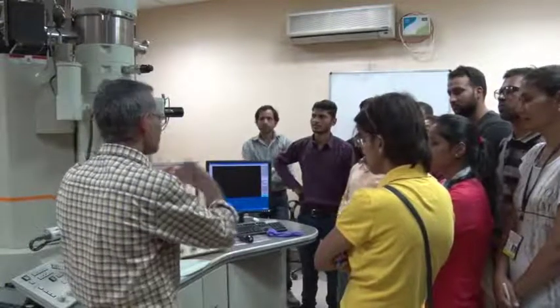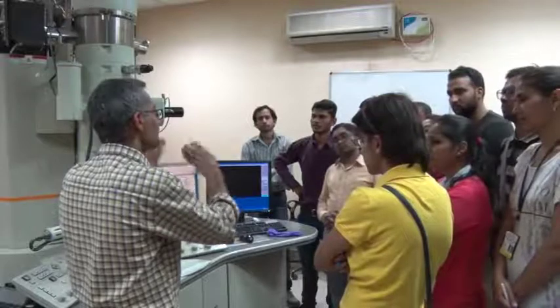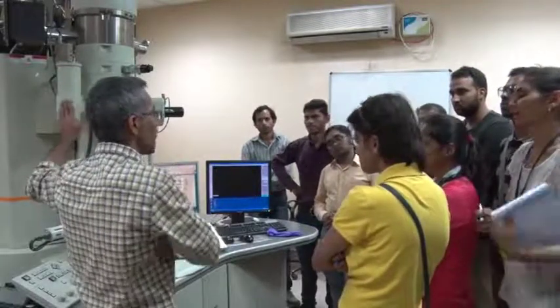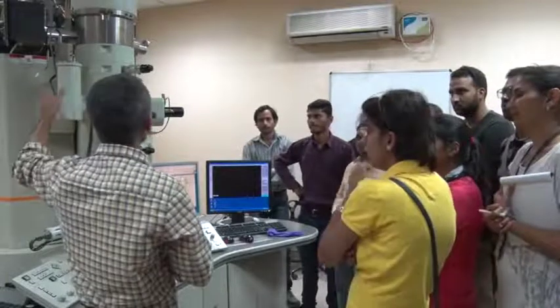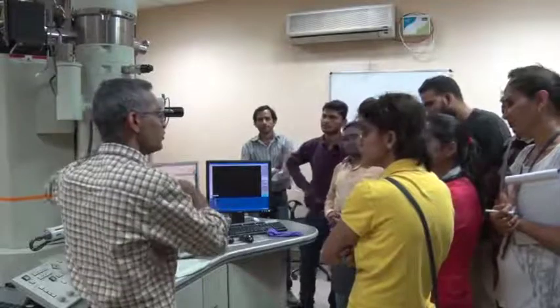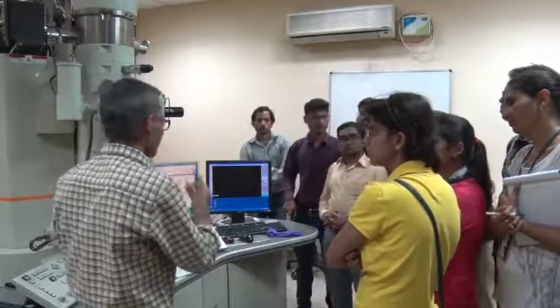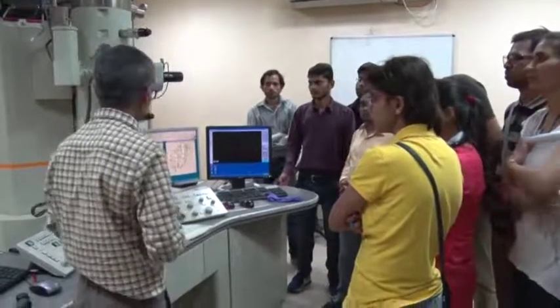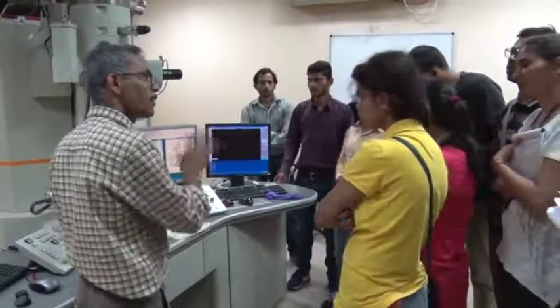And if, for example, something has been coming out from the sample, it will be quickly absorbed by the cold surface around it. So it's called an anti-contamination device. First of all, it will prevent the contamination of the sample, and by maintaining better vacuum. So that is by and large the purpose of it. So we are fine, yeah?